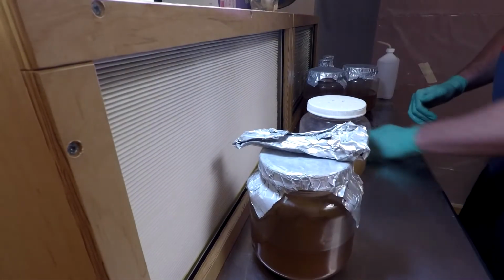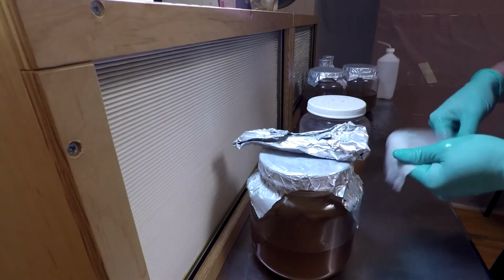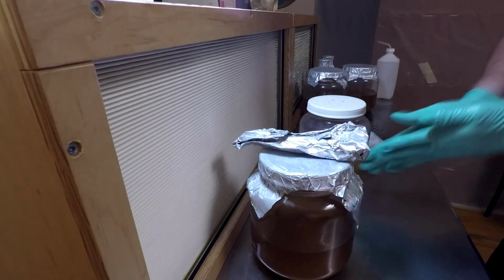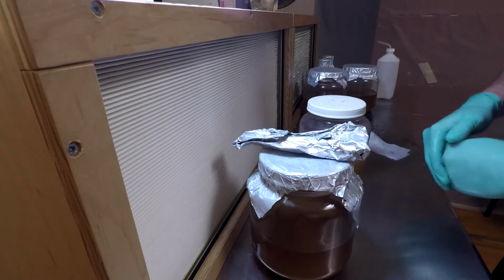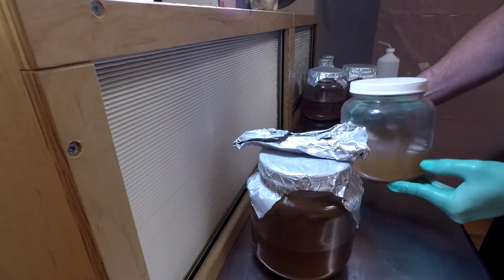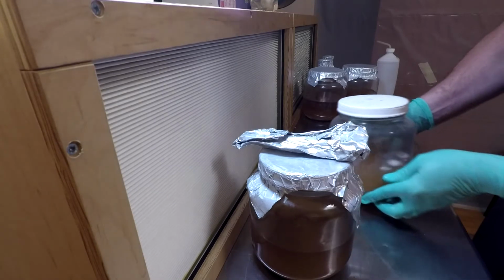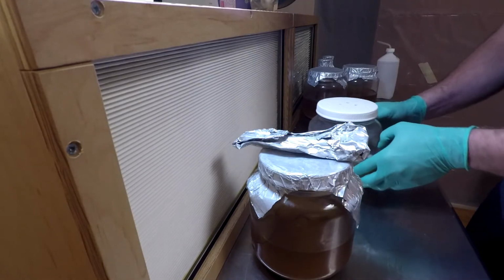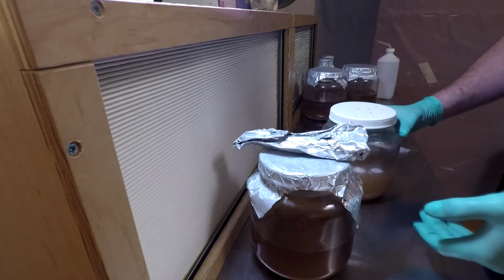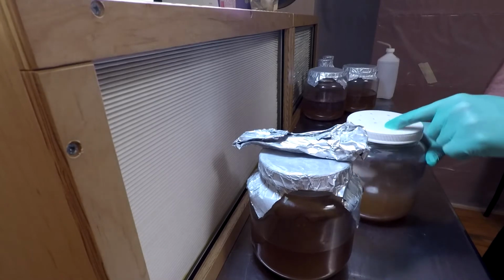Hello everyone. Today I'm going to do some transfers of this master liquid culture that I made back on the 31st. You can see I've already mixed it up. It's about halfway colonized and you can see there's floaters on top. Looks really healthy. I've already taken my spray bottle of alcohol and really saturated the top, especially in these holes.